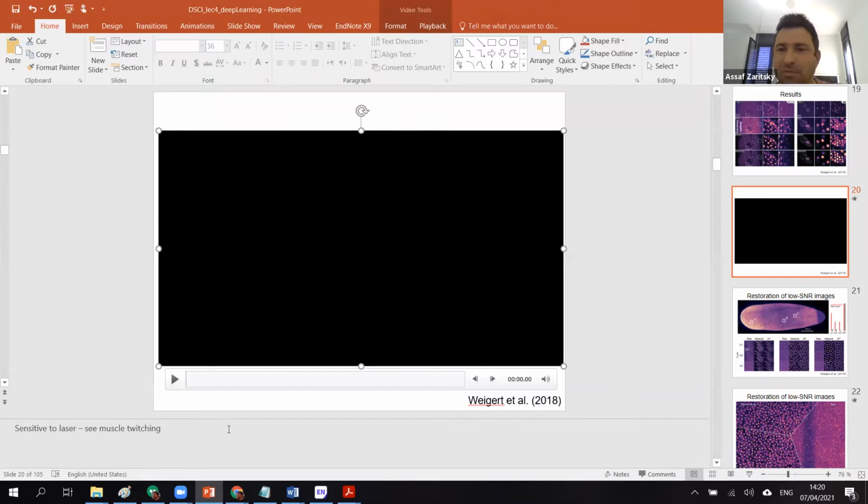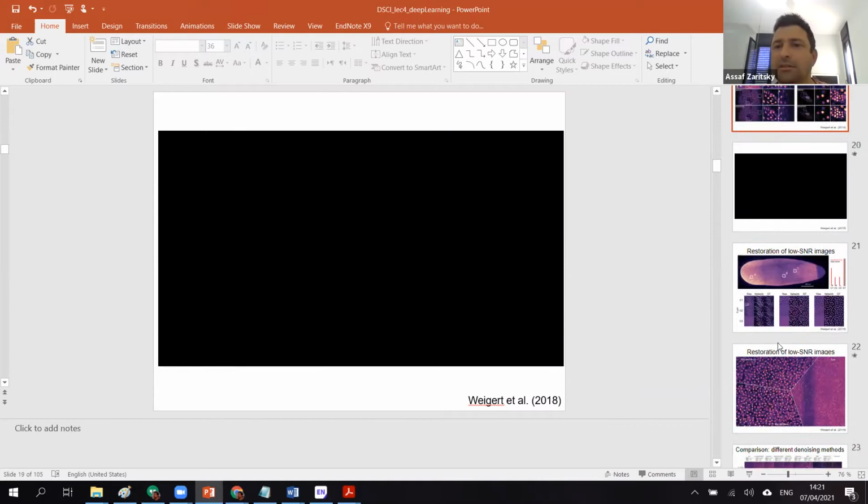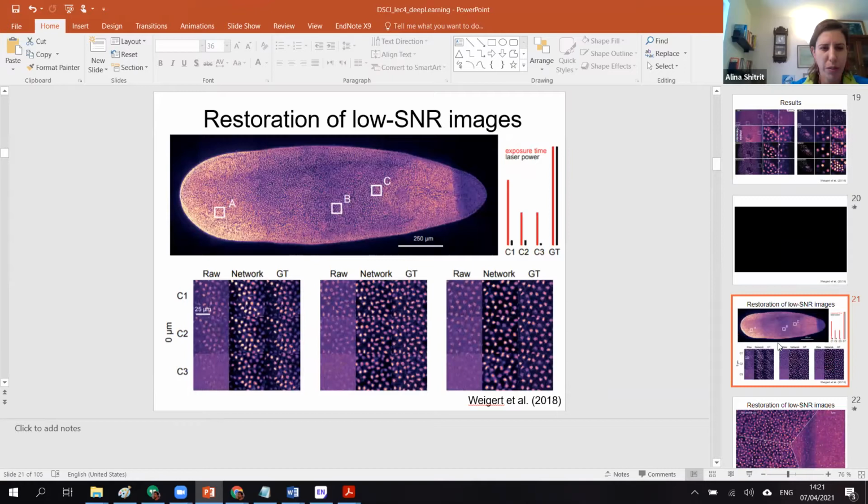Assaf, sorry, maybe I missed something. Why did you get rid of the twitching? Because of the algorithm? No. The twitching is a real thing within the animal. It's actually a very nice demonstration of why this is so important.